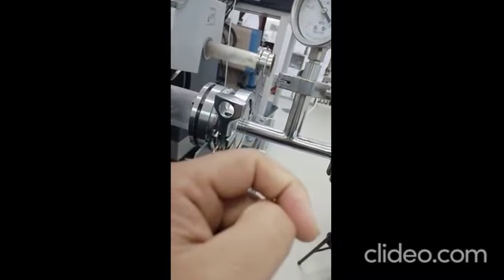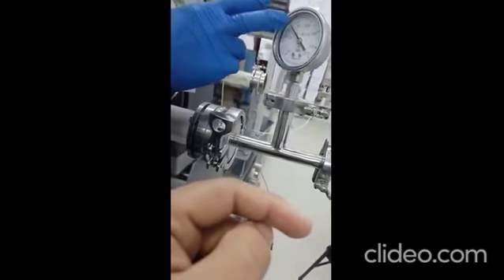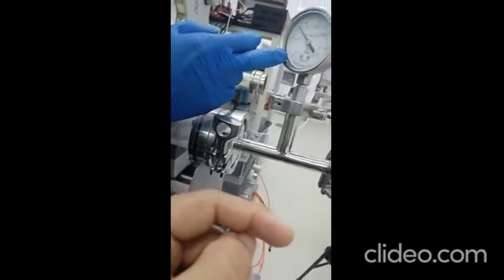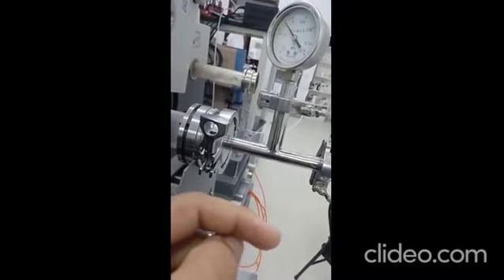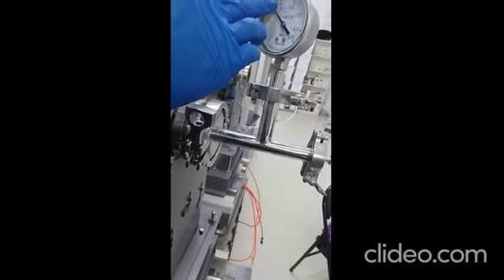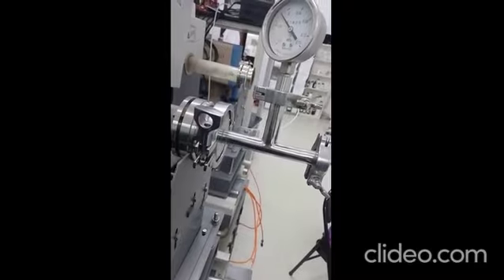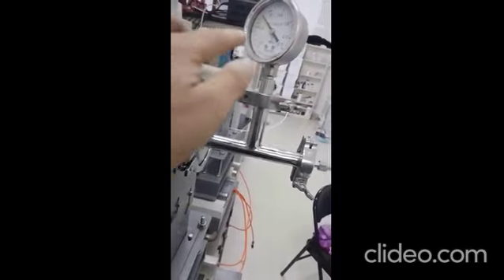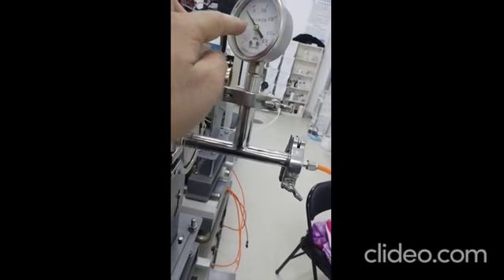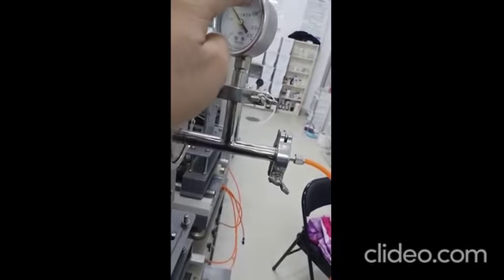No. This is 0 Pascal in fact. This is minus 0.1 and minus 0.05. So it comes from here, I think so. Yes, 0 is here like this.